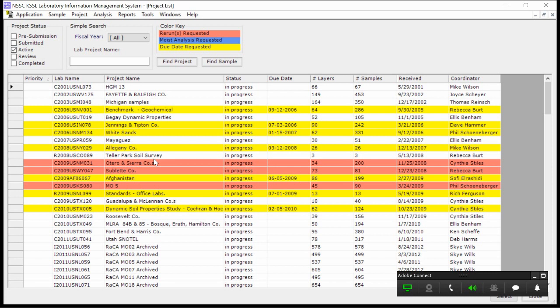So ones with a priority will be at the top, ones without will be at the bottom. Generally, they're added as they arrive to the bottom of the list, just as received. The priority number is generally sequential as they are received or validated. But like I said, we can adjust that at any time.